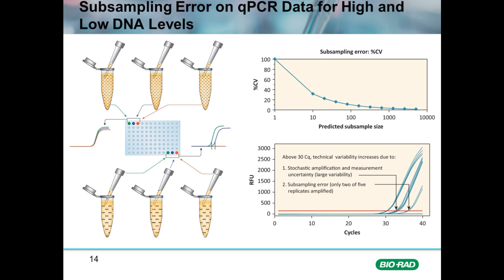However, when the samples are much less abundant, as shown by fewer dashed lines for target molecules, the amount of target taken from each sample can vary dramatically. In this particular pipette tip, several target molecules were taken up. However, in the second draw, fewer target molecules were taken, and in the third technical replicate, none of the target molecules were taken. This is called subsampling error.